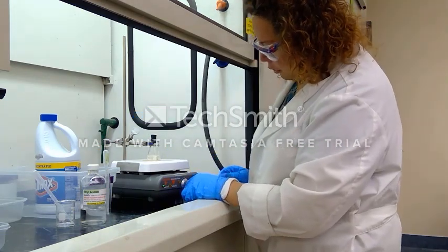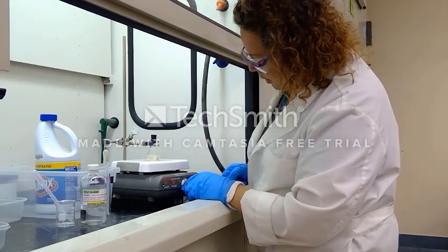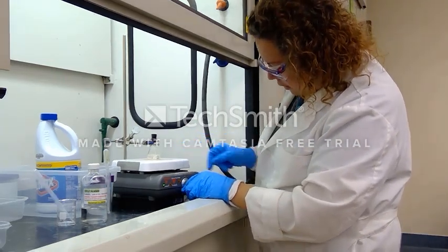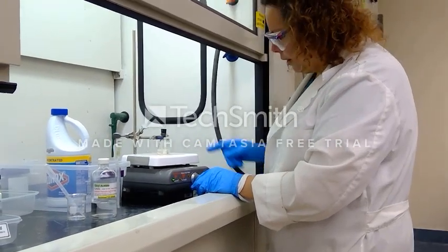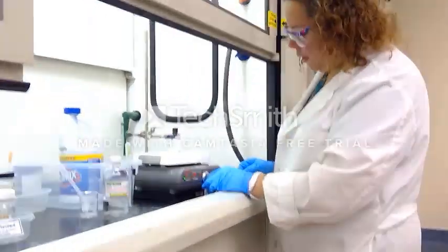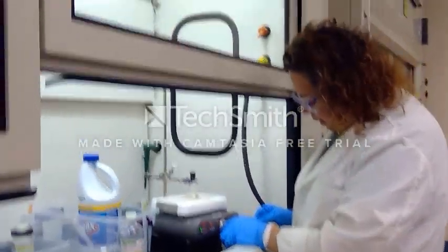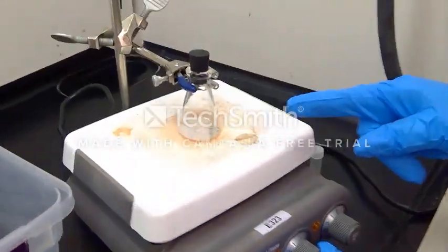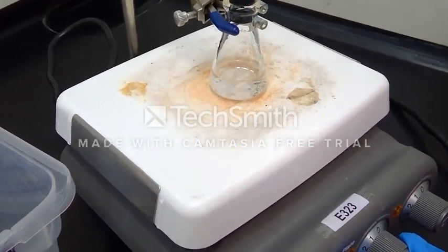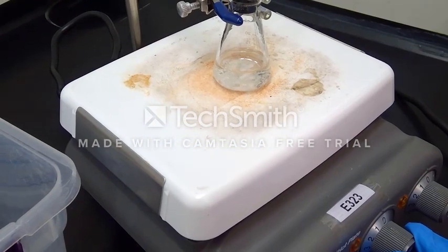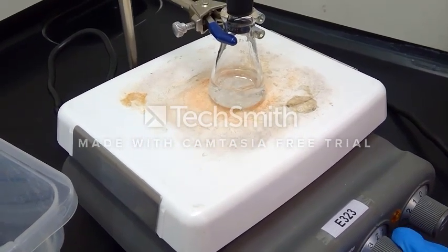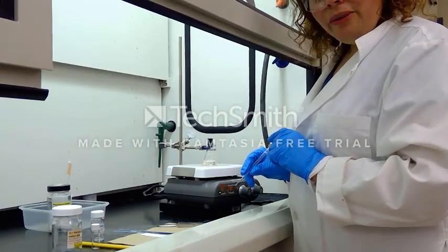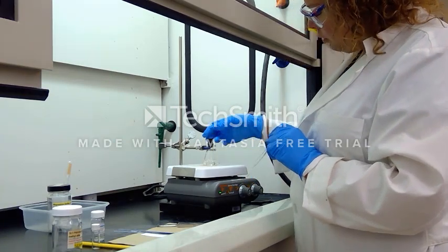This is all going to be done at room temperature. I'm having the camera moved closer so you can see we are having a little bit of reaction as the solid is dissolving — it looks like we're creating a tiny bit of gas. I'm going to go ahead and start the stir.